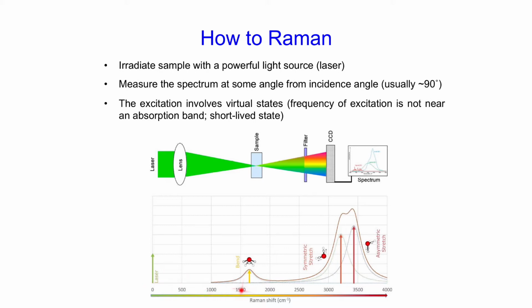So here is a typical Raman spectrum. Okay, your laser light would be detected over here. So if we didn't have a filter, see here, there's a filter right there. If we didn't have that filter in there, we'd see a big giant peak here corresponding to the scattering from our laser light. That would be our Rayleigh scattering. Okay, and then this is just showing one arm of our other types of inelastic scattering.